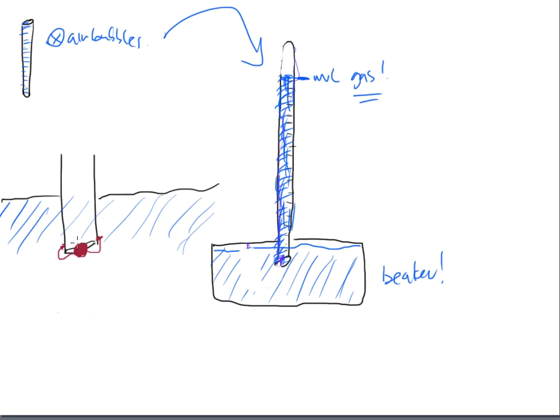So what goes on is that we start to see gases that get generated in the eudiometer, and those gases are going to be captured because it is right there at the site of where the activity is taking place. No flask, no bent glassware, right at the entrance of the eudiometer. It's going to generate gas, and the majority of that gas is going to go up, not down. And because of that, the eudiometer is going to give you better data as far as volume of gas that's collected. All right, so that's going to be a start in the right direction.